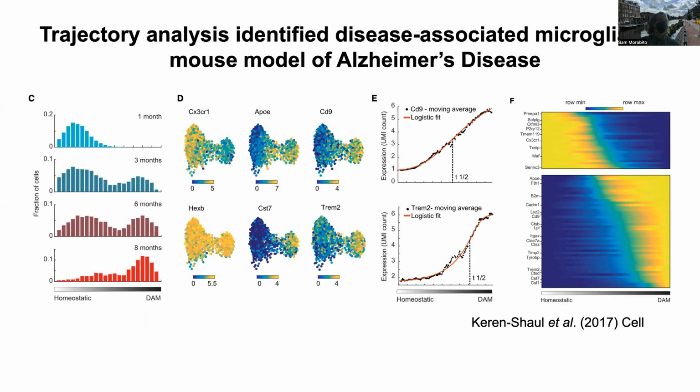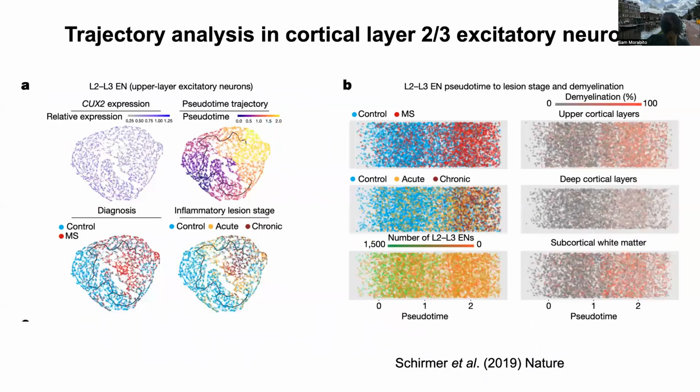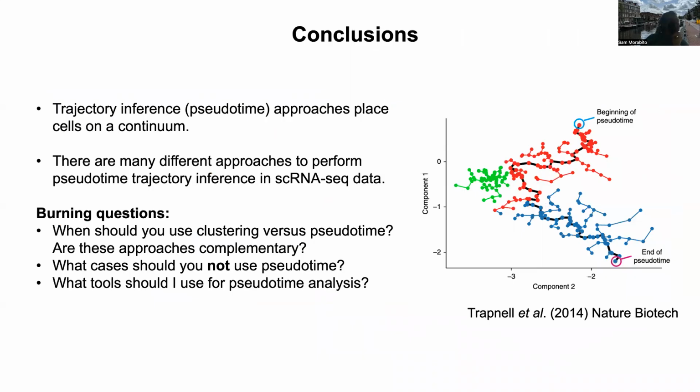It's a random question. Do you know if these are also usable for epigenomic marks? Yeah, definitely. So Nagin's asking if we can use pseudotime for epigenomic data, and you definitely can.